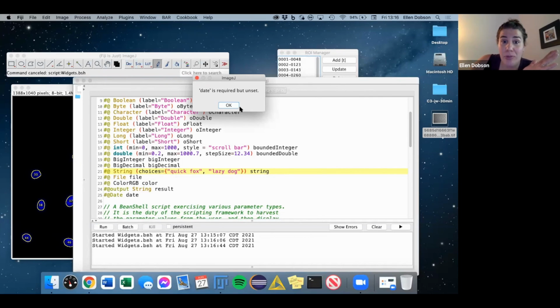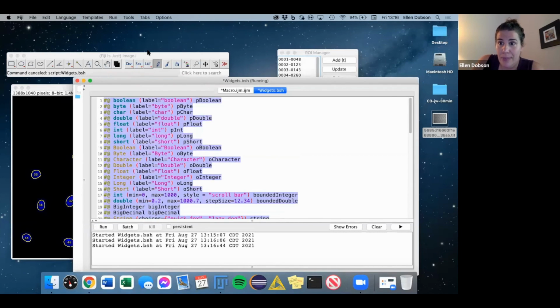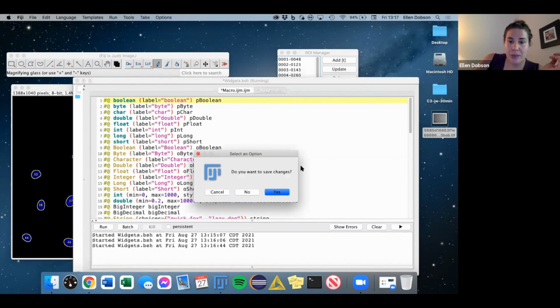So, the rules of these script parameters. The thing that's cool is you can just copy and paste these and use them in your scripts without worrying about the language. The parameter declarations begin with this hashtag @. That's how they're recognized by the system, that it's a script parameter, nothing else. So you have the variable type and the name that are declared. You can also have outputs, which we'll use to say you want to save data in a certain output folder. So basically, you can copy and paste and use those in your own scripts.